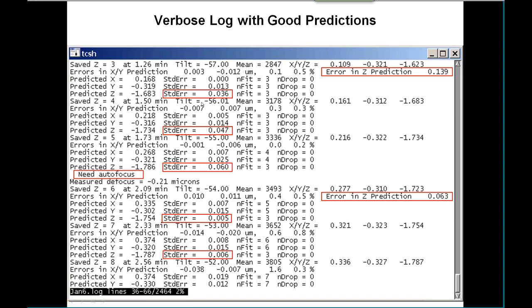You notice the standard error grows because we're extrapolating farther and farther out from those three points that we measured. Finally, it's time to autofocus because we scheduled an autofocus at this time, and the defocus is only off by a tiny amount, so it's quite happy. You can see the error in Z prediction was very low, and now off it goes continuing from here.